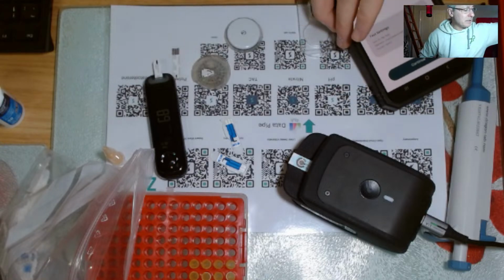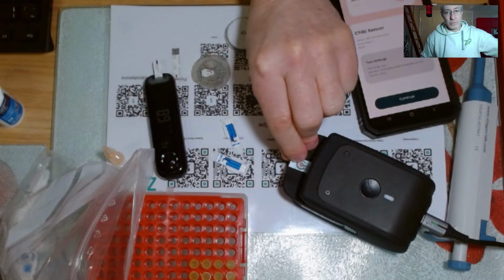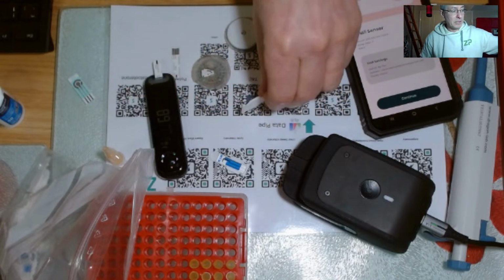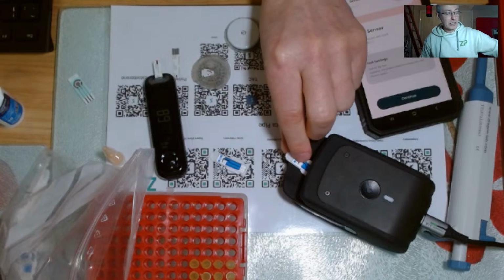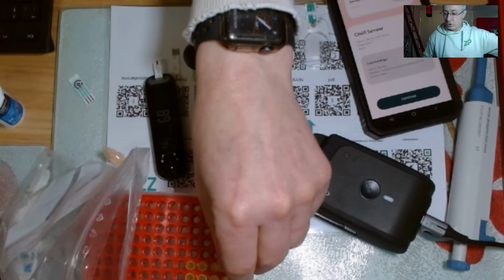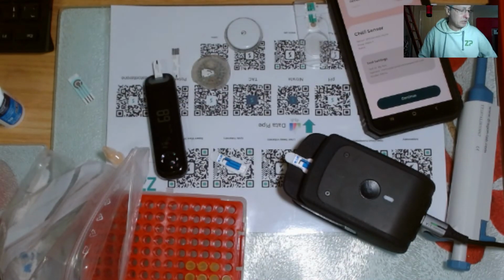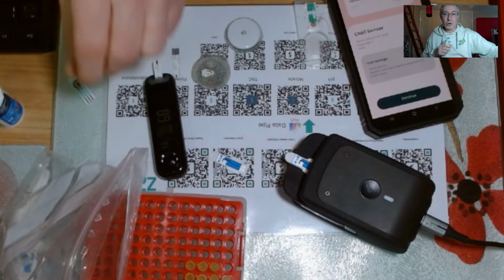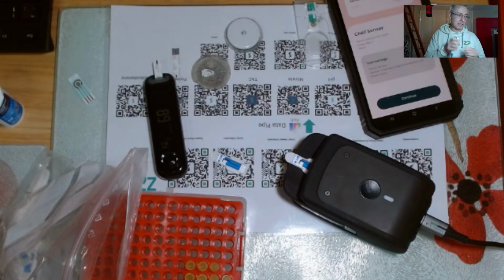In fact, I'll give you another demonstration. I will talk about the stability of the question, but understand that stability of screen printed electrodes is not actually what we're promoting. If you watch a lot of our materials online, I always think that screen printed electrodes play a really good role in point of care, point of need diagnostics. I really do think they play a great role.